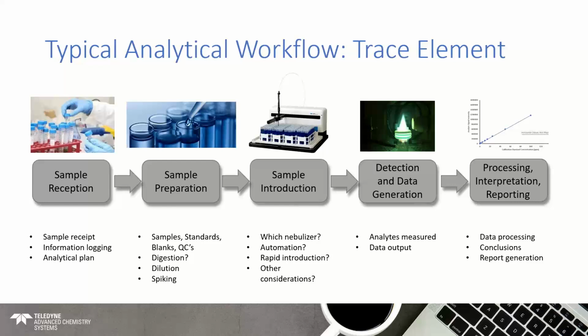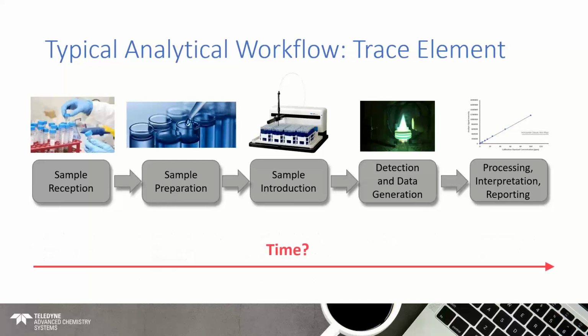Now, the thing to note about this is that the whole process takes time. You might have a certain workflow in place with laboratory staff dedicated to certain areas. There might be dedicated staff for sample reception, for example, or the preparation side of things. But the whole process takes time, and that time is dependent on the samples that you have and the analytes that you're interested in.